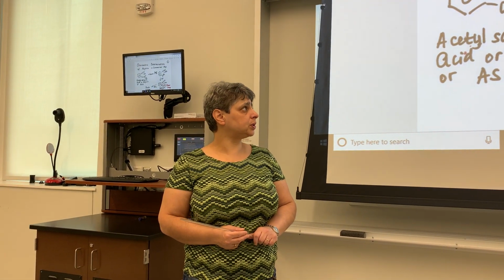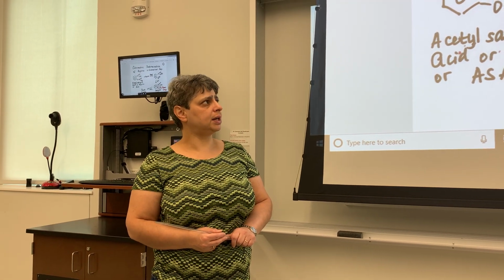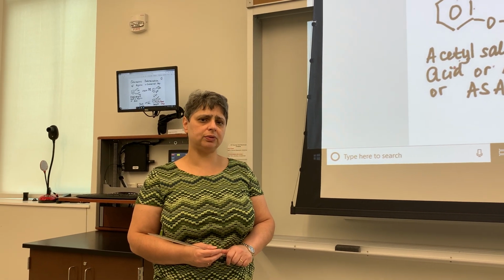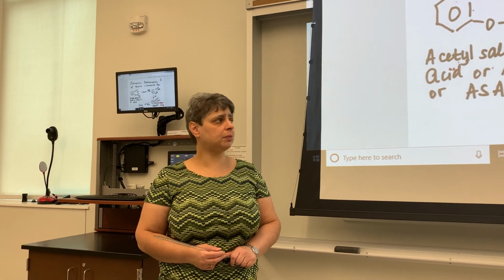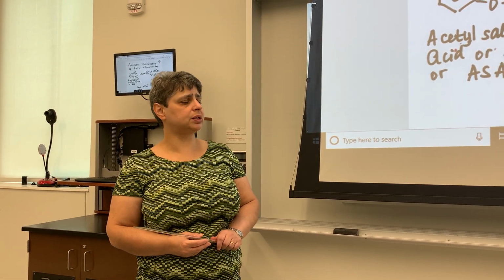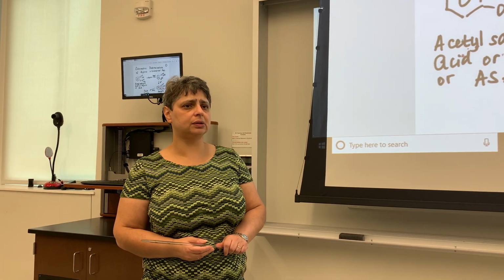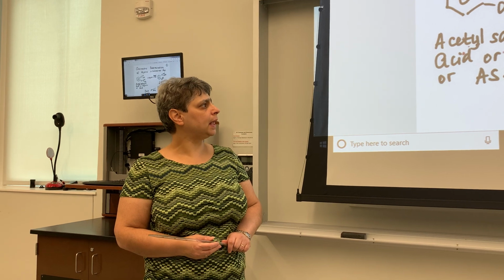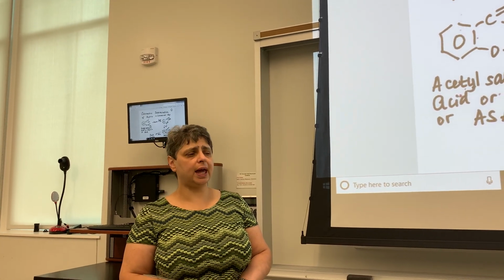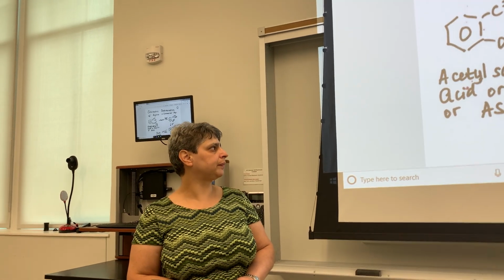For example, aspirin is often combined with caffeine and acetaminophen in a medicine similar to Excedrin. You probably have heard of Excedrin, a very widely used headache medicine. It is believed that this combination of aspirin, caffeine, and acetaminophen would help fight headaches better than a single-ingredient medicine. And so the goal here is to find the mass percent of specifically aspirin, or acetylsalicylic acid, in such preparations.